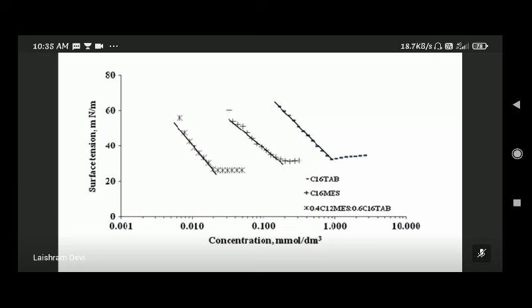Now if you are done with the first solution, then you start the second detergent solution. You will count its number of drops as well, right? 3 times the number of drops, concordant readings should come. Like this you have to repeat the whole procedure. Whatever number of concentrations of detergent solution are given, 5 or 6, for all of them you have to find the number of drop values.